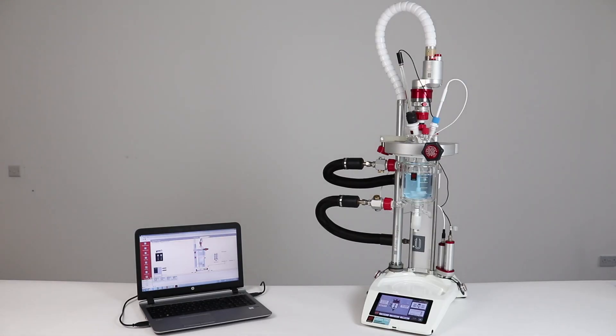The new Atlas HD firmware unlocks access to a wide variety of applications, and in combination with the Atlas PC software, offers automated control of compatible RS-232 controlled devices such as balances and peristaltic pumps for gravimetric dosing.